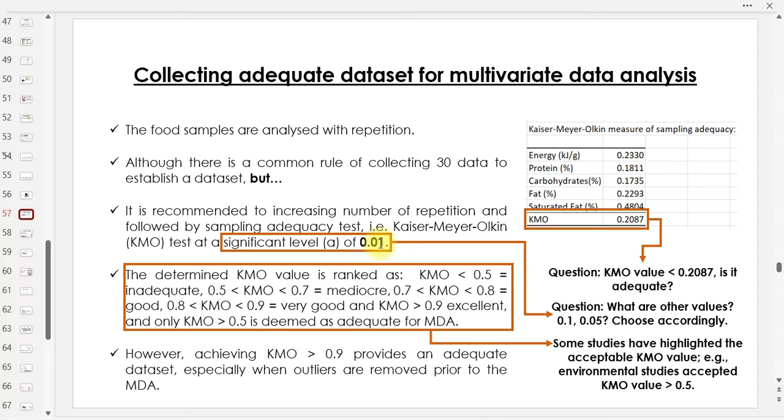1% je cosine tu. Kita memang takkan terima for halal. Kalau environmental study tak ada issue. There is no issue, 1% je this. Dioxin tu boleh menyebabkan cause cancer, but only 1%. So should be bolehlah terima. Okay, but halal no. It's very sensitive issue. That's why I increase to 0.01.